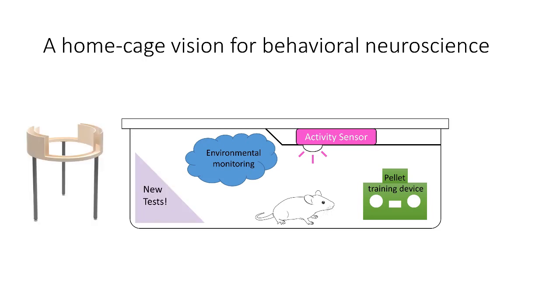To bring up the zero maze one last time, this requires thinking about what we are really interested in with this test. Is it measuring avoidance of light? Or is it measuring the attraction to a safe environment? If we can articulate this more clearly, we can create a sensor for this property and measure it continuously in an entire colony of mice.